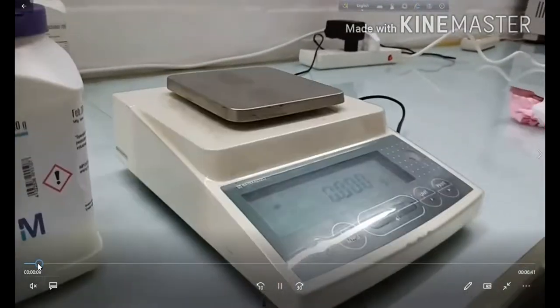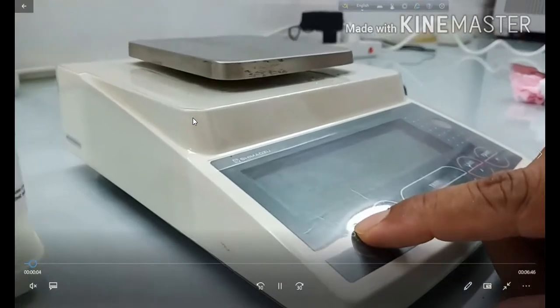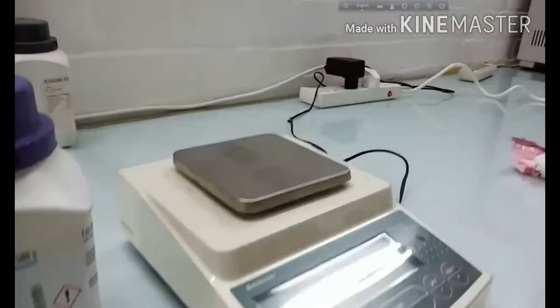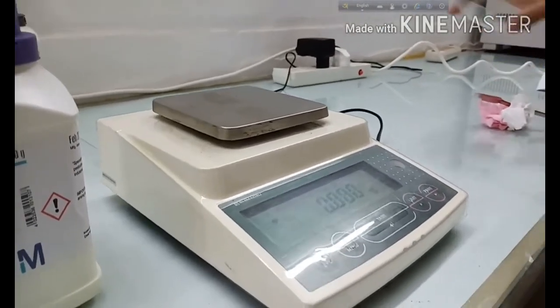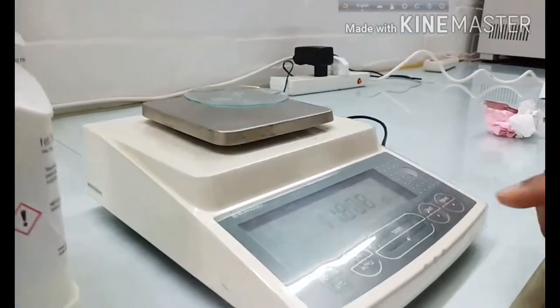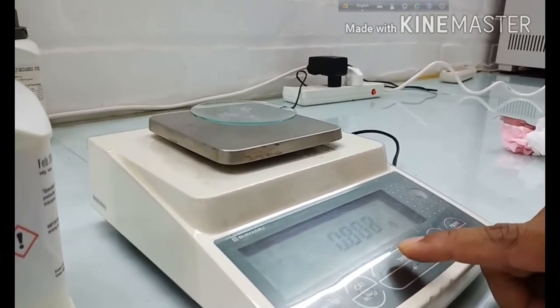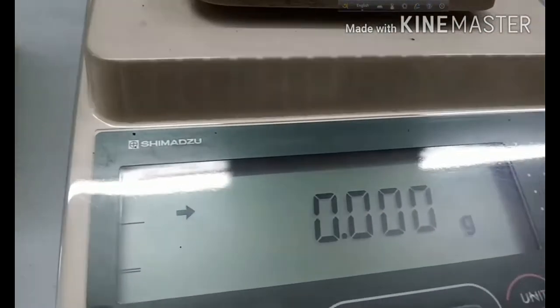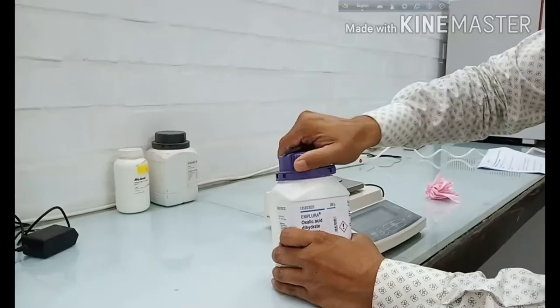Okay, I'm giving it from the beginning. So this is the weight machine. After calculating the weight in phase 1, you have to take the weight of the chemical species, that is oxalic acid, using a watch glass. It is the weight machine here. So can you see that we have made it 0?